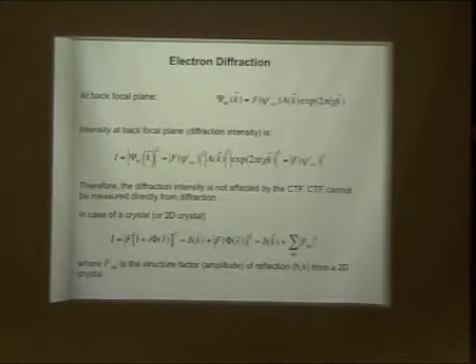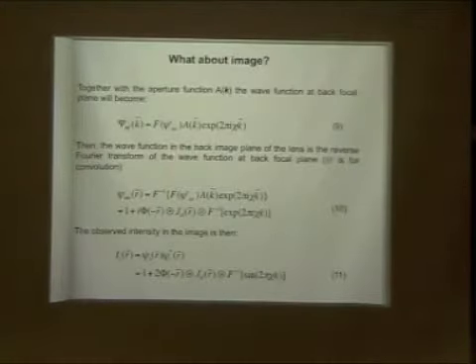You can't do that. And of course, you can also go further down from here. You will get an image. If you do another Fourier transform of this term, you end up with how the image looks in your imaging plane. And what you actually record is this intensity, right? So in this term, it's basically your projection potential, but modulated by the CTF. That's why the image you look at is not exactly the same as your projection potential, after the contrast transfer function modulation.